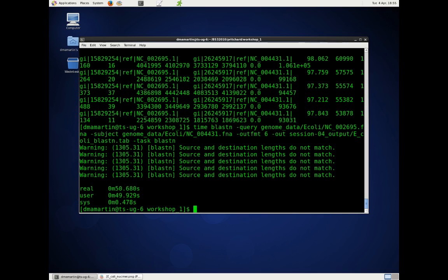Now there is another algorithm, one called MUMmer. That runs in a slightly different way, and what we're going to do with that is identify matching regions with it. That will produce a delta file. We're going to get rid of all the tiny matching ones, so from the delta file that will create a filter file, and then we will use show-coords to generate a human readable alignment from there. We can plot that as well using mummerplot. So we'll go through and do all of these, and then we will visualize it. And then we will move on and use the Artemis tools.